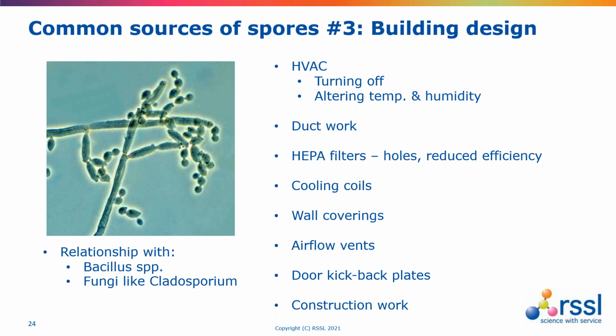It's also important to avoid dust. Dust in any clean room is, again, something that will be problematic for contamination, and also any blocked vents as well. And even in the most highly controlled clean rooms, so if you go to look at the papers published around the NASA Mars clean room projects, where very high-grade clean rooms are being used, the microbial assessments show a strong association between dust and spores.